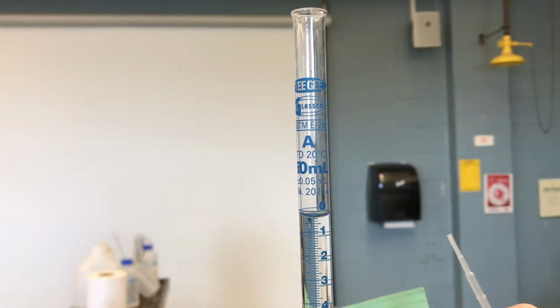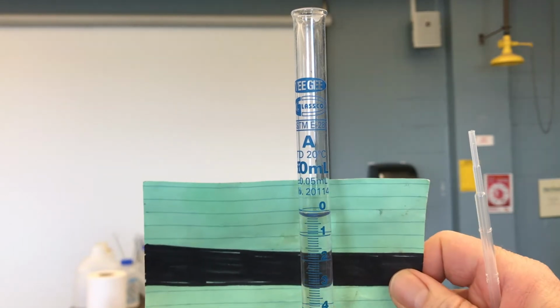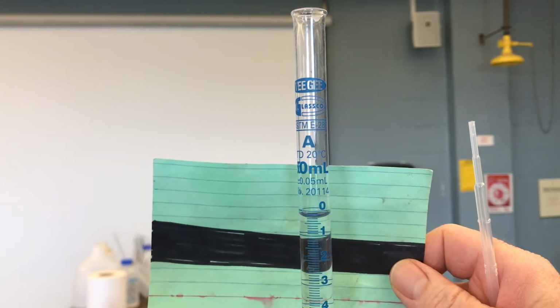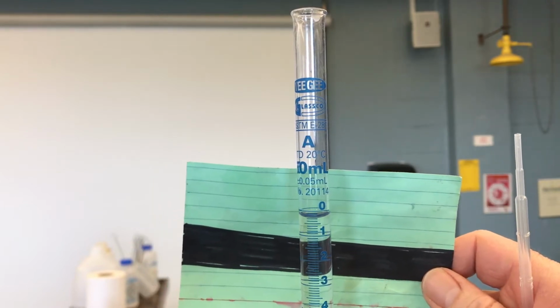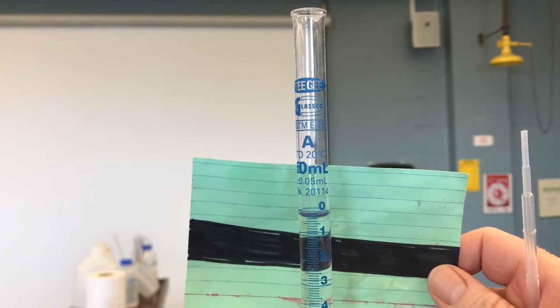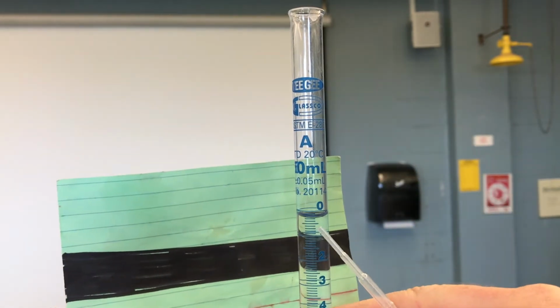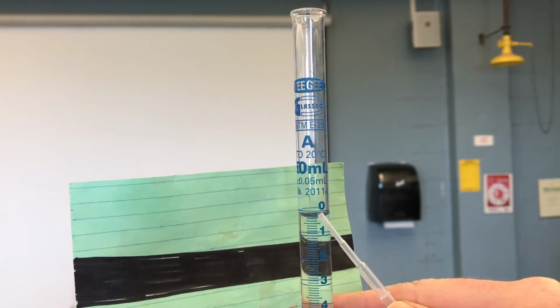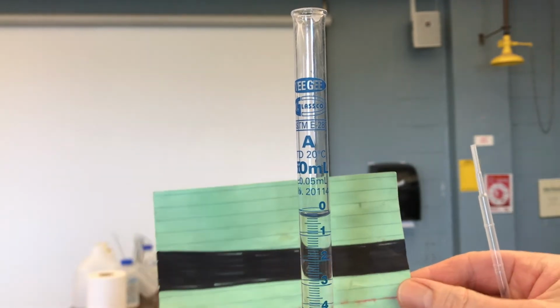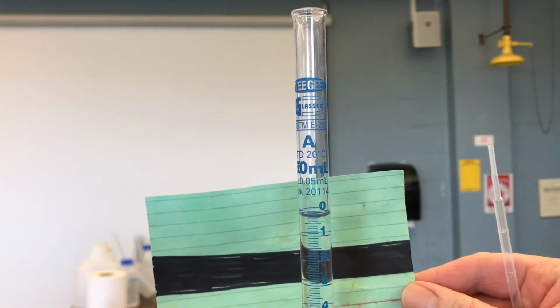So before I show you the photo, to show you the close-up, this is how we remember how we record volume on a burette. We use a burette card. We try to look at it straight, and you can see this big line, which is 0.5 mLs, and then you're counting backwards. So then you have 0.4, 0.3, 0.2. So what you have is this meniscus sitting around the 0.20 line.